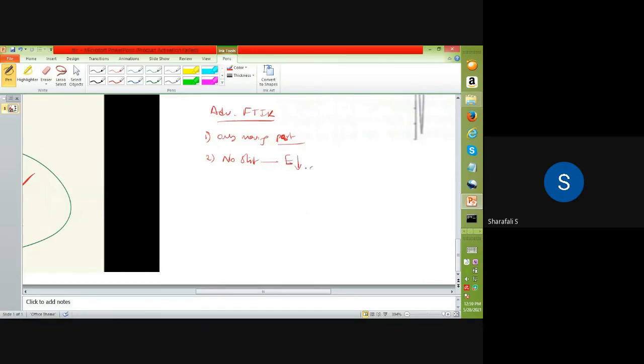Energy will be reduced in this case, so it is not a good spectrometer because we are not considering all the infrared radiation. But in FTIR we are considering all the infrared radiation. In a conventional IR spectrometer we pass the IR radiation through the slit, because a fine slit increases the resolution of conventional IR, but we will not get the full energy of the IR spectrum.